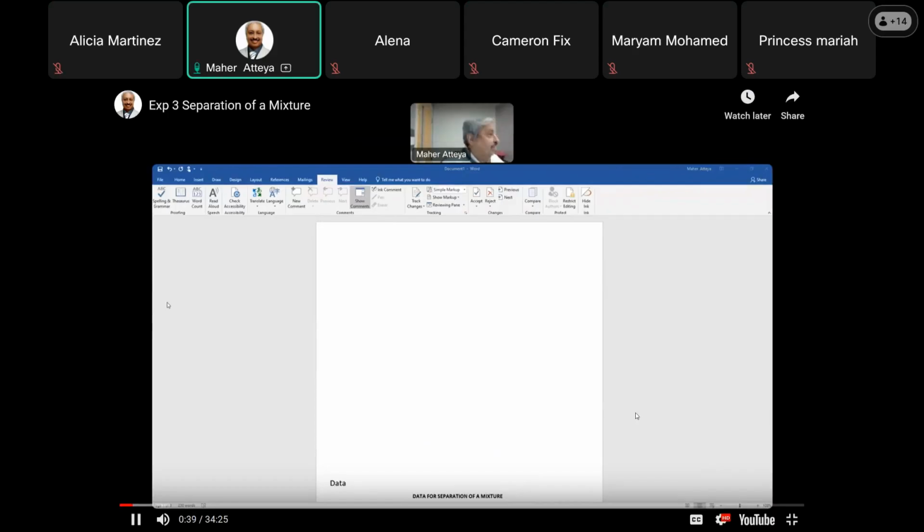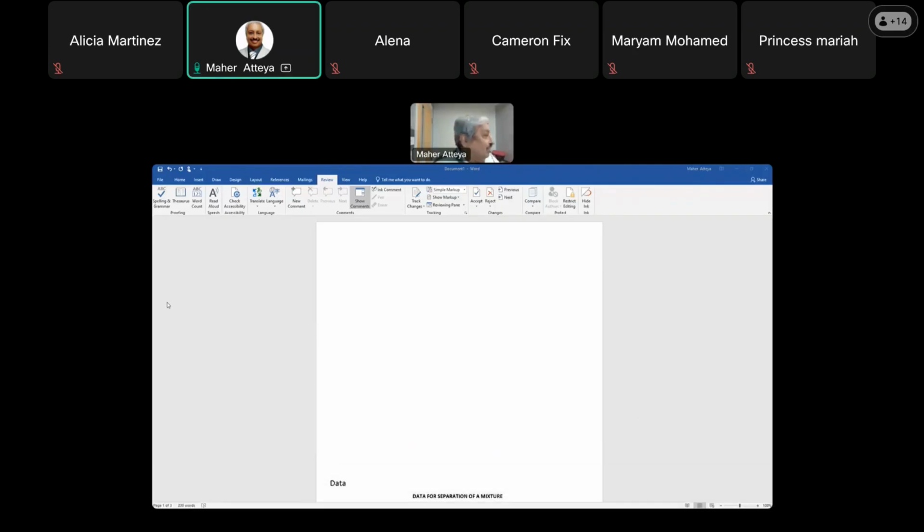Well, if I make it darker on the screen and here, darker here, then the recording will be, yeah. I'll put all the examples here. You can see it. Take the pen here. So today we'll have a mixture. This mixture is made of three things here. I hope it will be right. Yeah, ammonium chloride, and then we have.